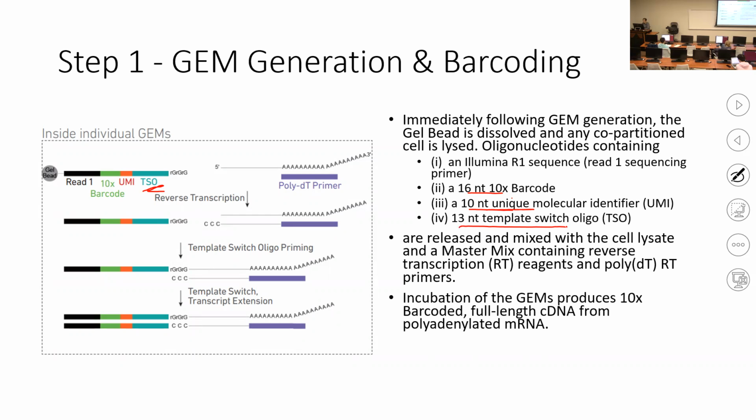Then you have this specifically designed reagent to do reverse transcription. Okay, and their poly-T primers, which here I don't know exactly how this was designed. It looks pretty sophisticated, but anyway, at the end you join your switch oligo with this, and you can start to amplify this piece of mRNA.